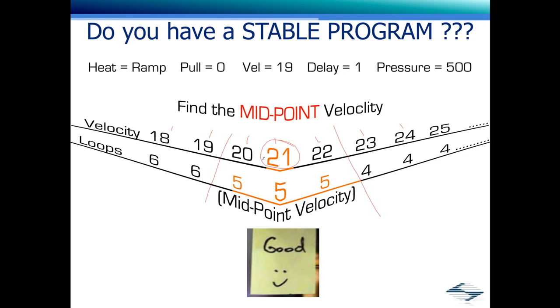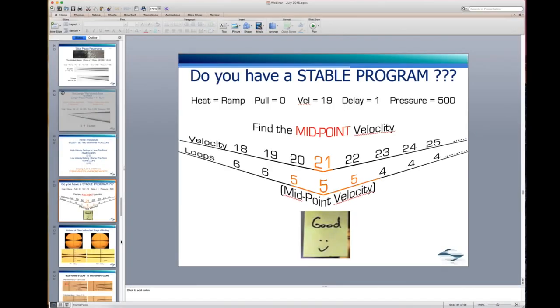So we have gone for a full hour now, but on one hand, questions are still coming in. On the other hand, very few people have left the webinar. So I would suggest we go for another 2 or 3 questions and then address the rest by email, but we will still leave the session open for a little while for people to ask further questions. Does that work for everybody? Sounds good. Okay, there's a lot more questions to go through, so sure. Let's go to the next one.